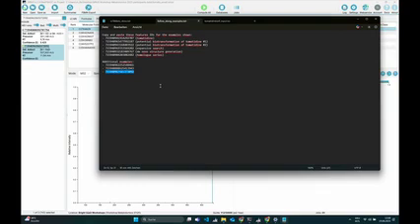About the fingerprints that you showed at the beginning, which are the foundation of the model. You usually use ECFP6, do you think it's okay? Are you trying to use something else, better developed, or is it good and we trust it because it's a foundation?